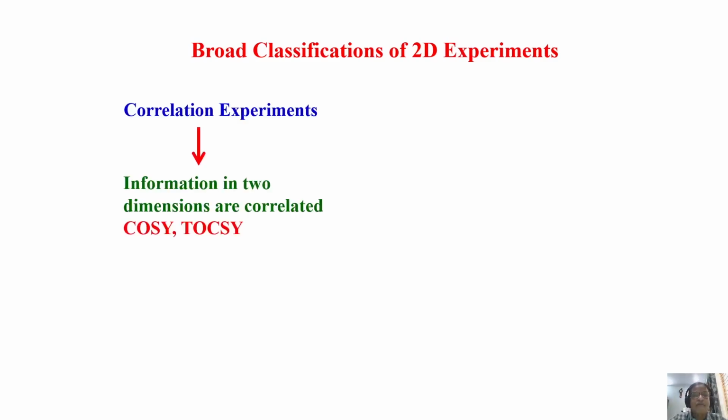So, now I am going to tell you what are the types of 2D experiments which can give you information, and what type of information you can get from that. Basically, I will classify the 2D experiments, or in general multi-dimensional experiments. You can take it as multi-dimensional experiments, but my focus is on 2D today, and for the remaining 1 or 2 classes, I focus on 2 dimensions. So we say it is 2D, but in general, you can classify these for any multi-dimensional experiment like this.